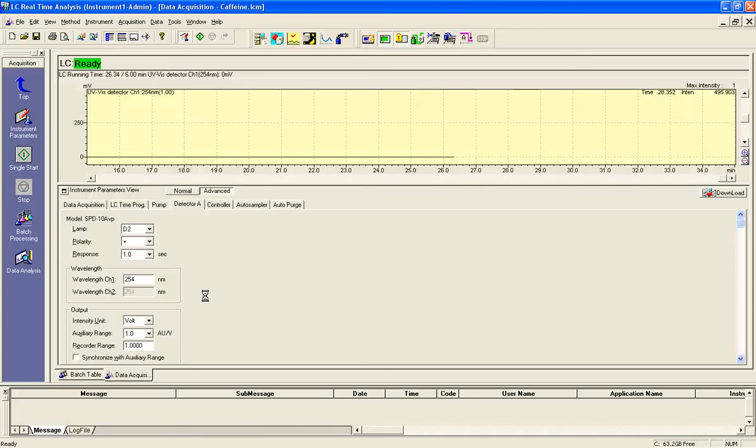You will have to look this up in the Merck or the CRC, and it will tell you what you should be dialing into. We are not going to provide that information to you at all. So, hint, hint, hint, be sure that you know where to find that info. Alright, so that's all that I need to do on the detector tab itself.